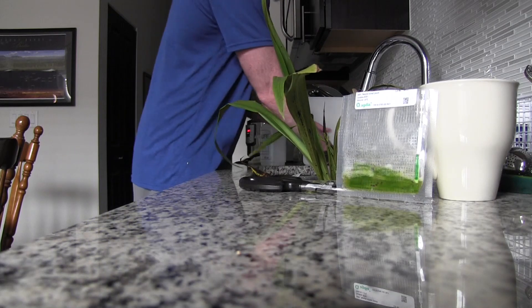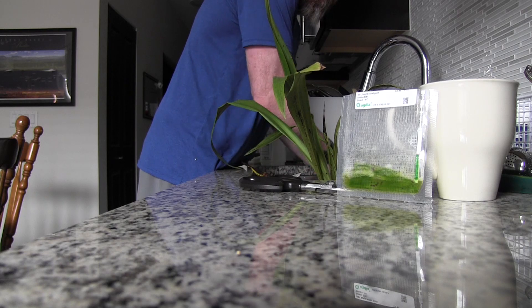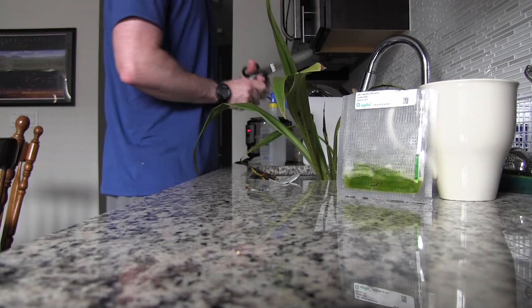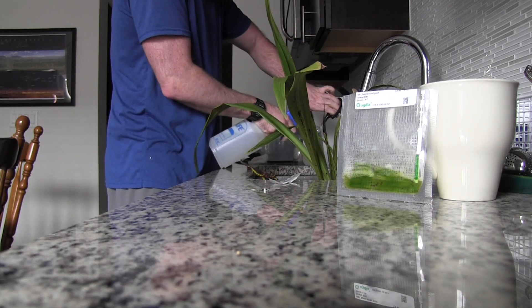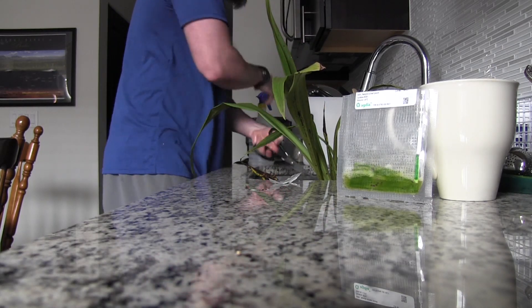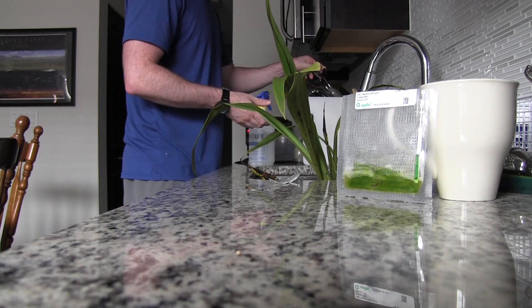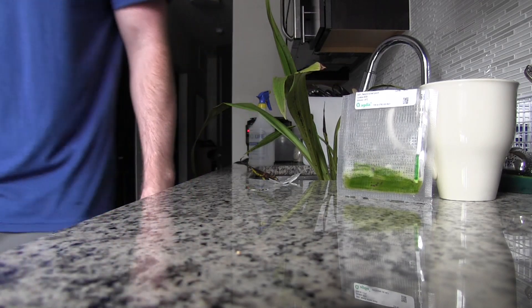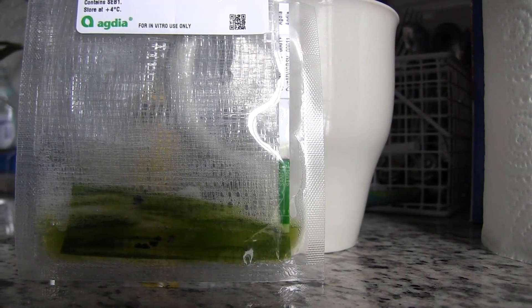I'm going to rinse that stuff off my hand — I don't know what it is. I'm also going to rinse off my scissors and give them a good spray. It'll probably take a few minutes for results to show up, so I will update you when we start to see something.